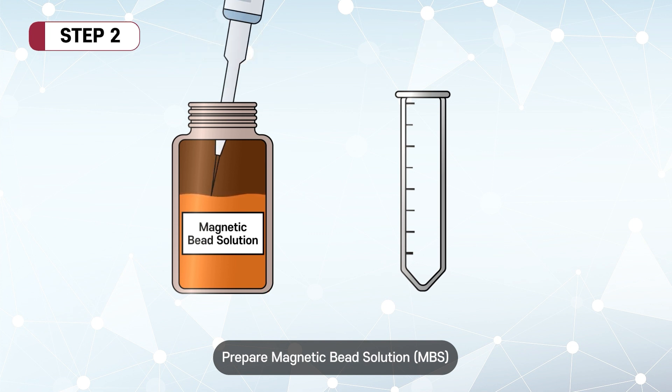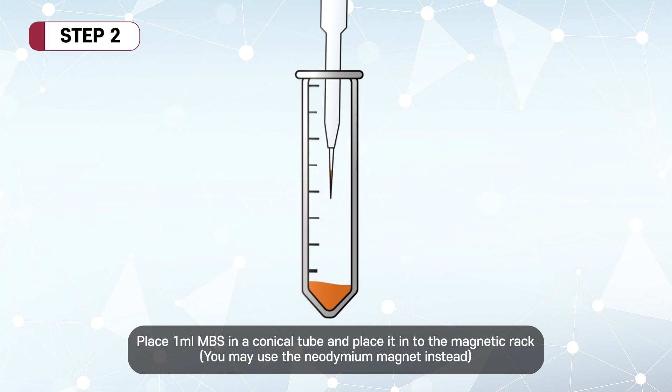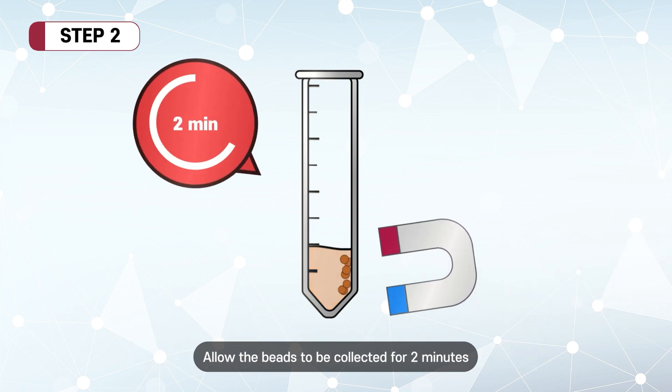Prepare magnetic bead solution. Place 1 milliliter MBS in a conical tube and place it into the magnetic rack. Allow the beads to be collected for 2 minutes.